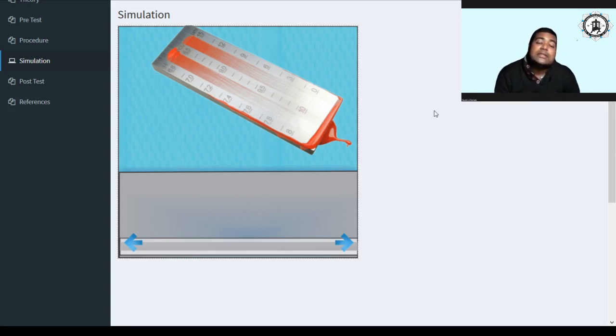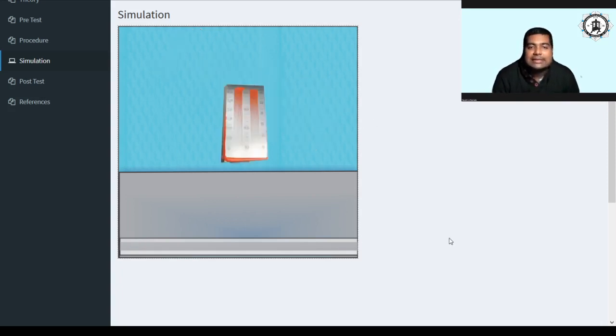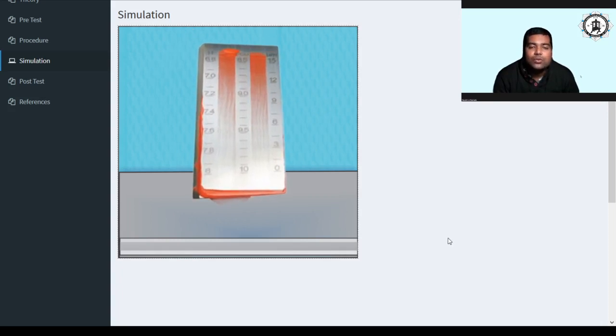That means when these pigment particles have reached the grooves where the depth of the groove is that much, 9 micron or 10 micron, then it is sitting on that groove at that particular end. And when you are trying to scrap the ink downward, it is creating this type of pattern, right? So that is how you can test basically, and this is a better, closer look of the experiment.